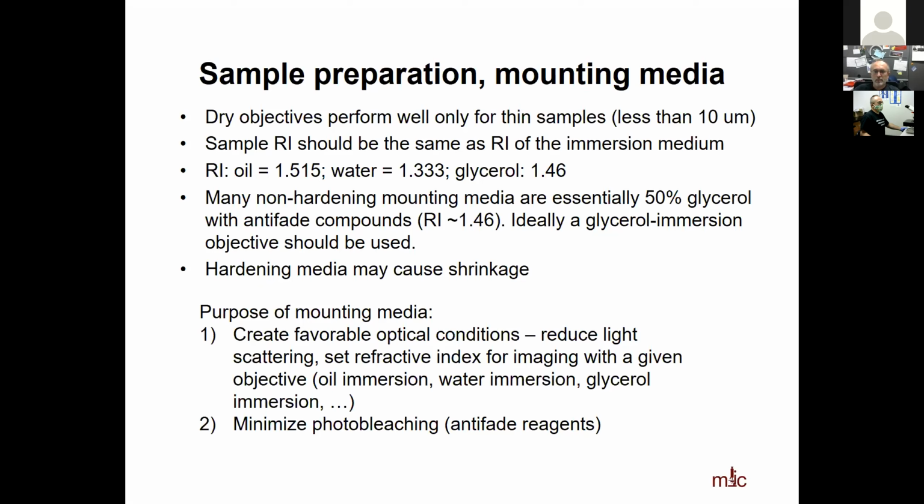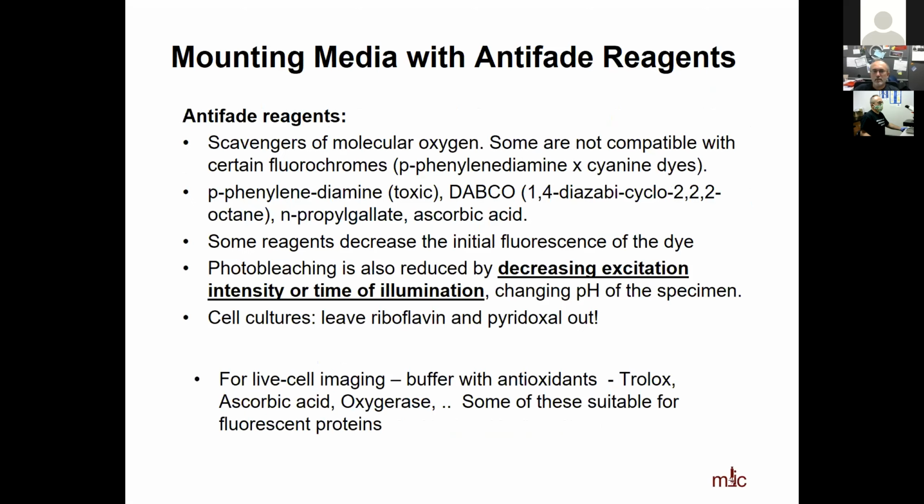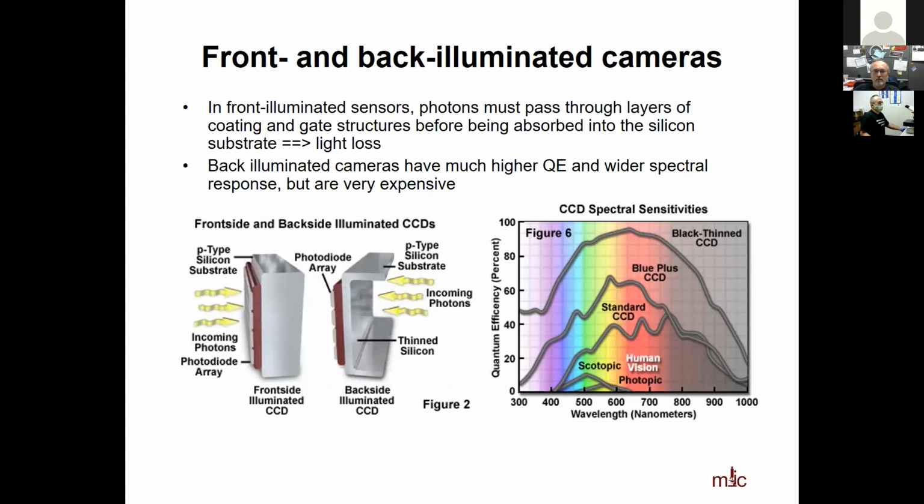A lot of these mounting media will also have antioxidants or anti-fade reagents. You just have to be careful because certain reagents are not compatible with certain fluorescent dyes. So, read the fine print. Okay, so that's the anti-fade. I think I'll just skip that. You can look at the options.